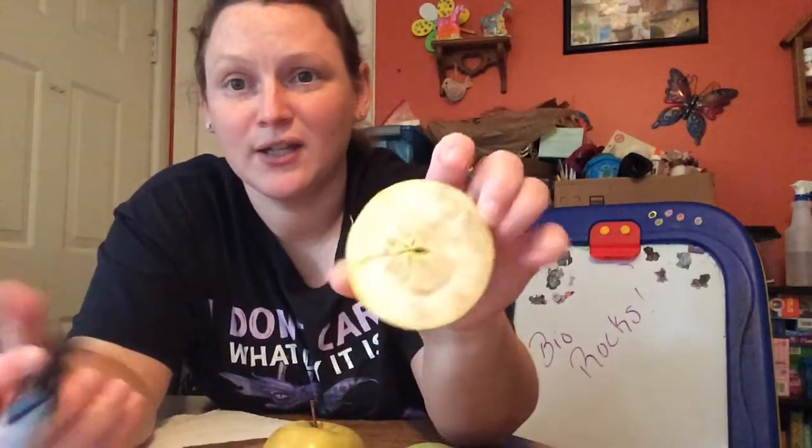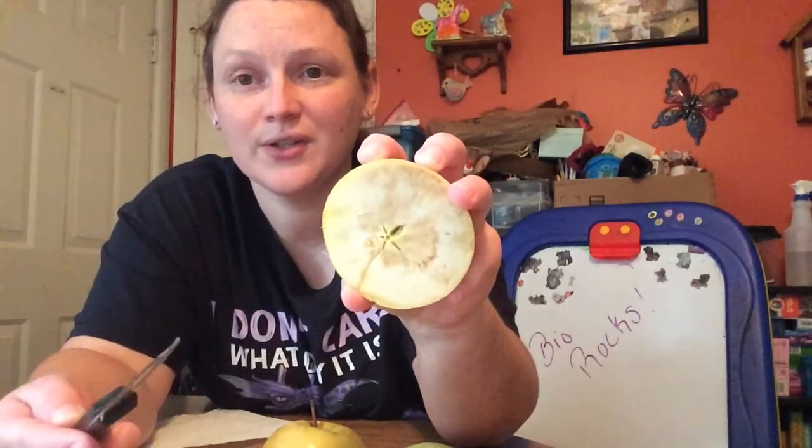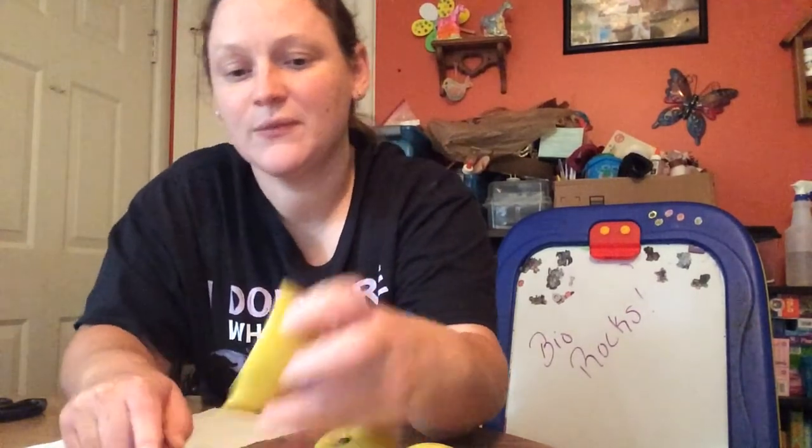Okay, and the embryo is growing inside of the seed, along with some nutrients that were packed up by the parent plant, to help that embryo in its development. So I'm going to cut another segment and see if we can see the stars a little better. So not so much, but here's another seed.